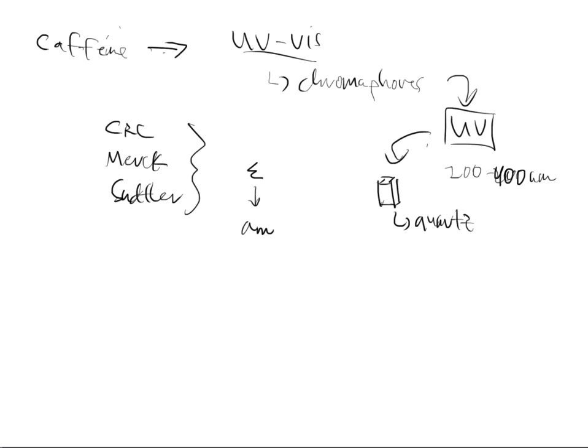All right, folks, so in the second part of this lab experiment, after your extraction, this is where the instrumentation piece comes in. And we're going to focus on the UV-Vis portion of the quality test that we can do with caffeine. There are many that we can do, but we're going to pick UV because that's the instrument that we're talking about. So with UV, as with many of the calculations that you've seen so far, Beer's law is going to be required.